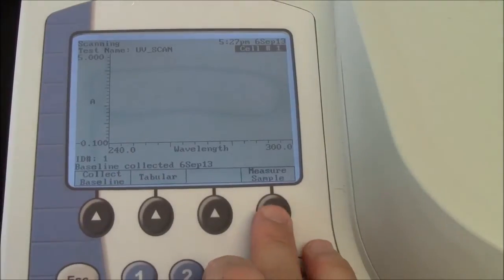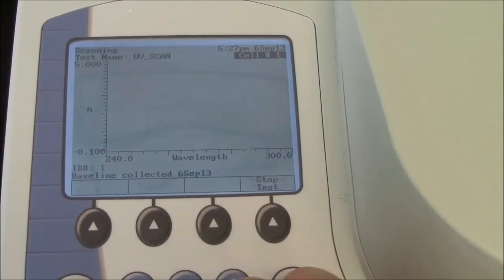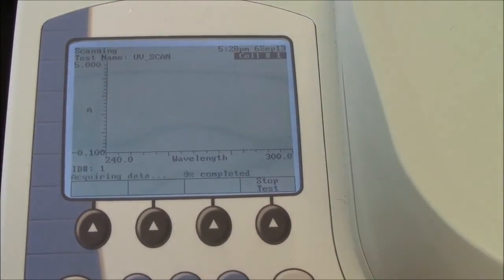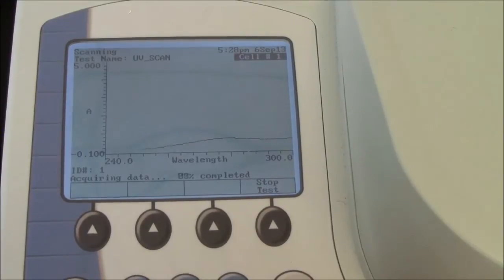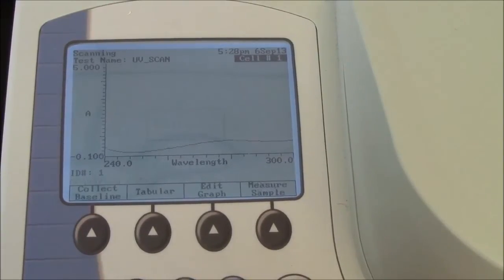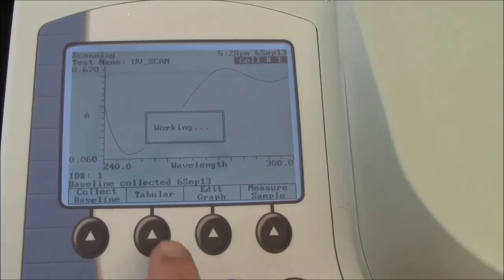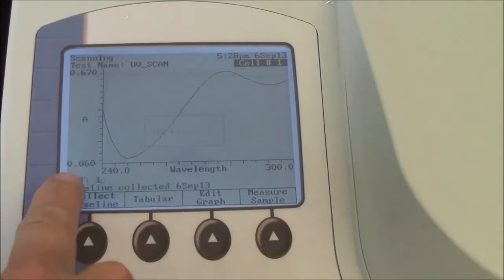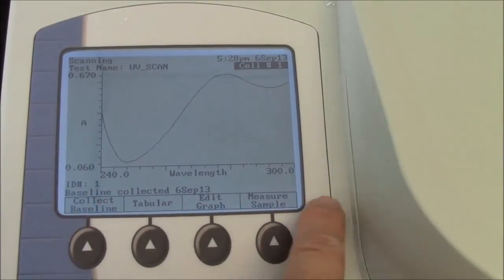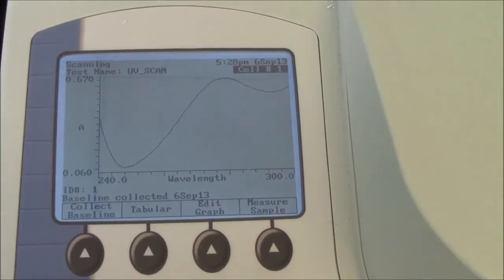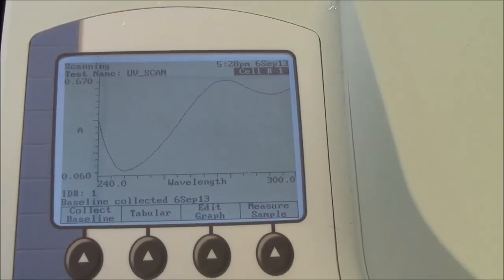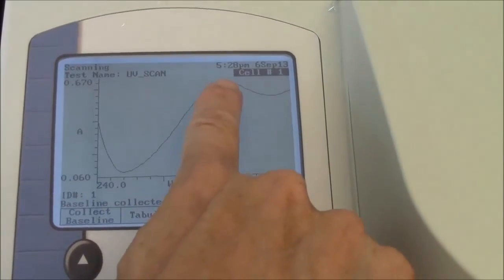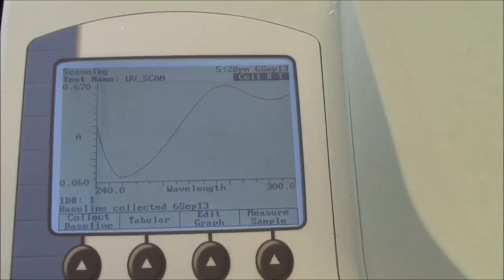I press measure sample. And I'm getting now a graph of absorbance on this y-axis versus wavelength on the x-axis. I have an interesting spectrum with one major peak here. And it looks like there would be a peak at a lower wavelength and there would be a peak at a higher wavelength as well.